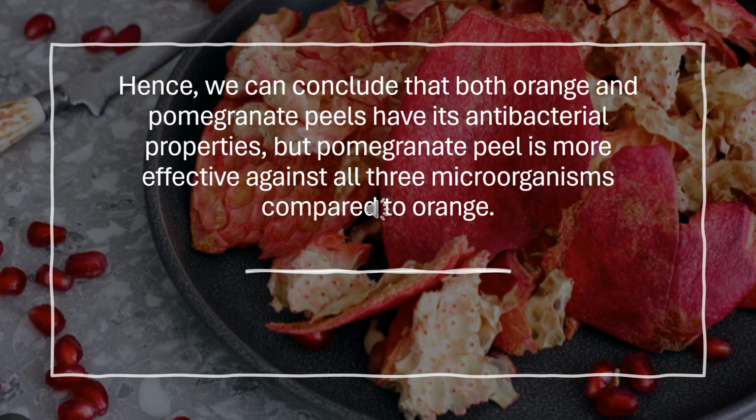The hypothesis of our experiment is hence proved. We can conclude that both pomegranate and orange peel extracts have antimicrobial properties and are effective on our organisms, while pomegranate is more effective than orange peels on our organisms.